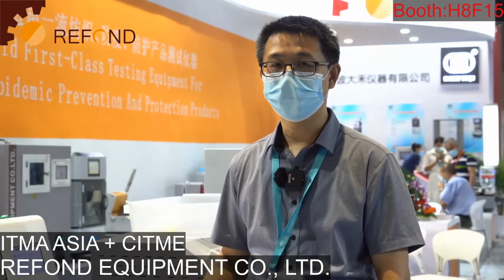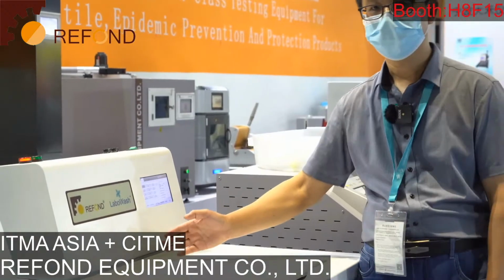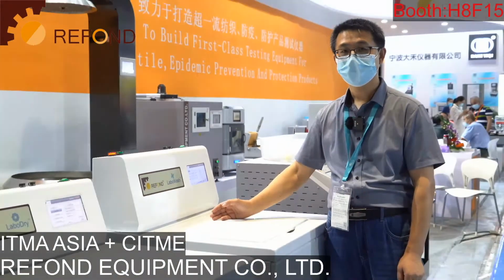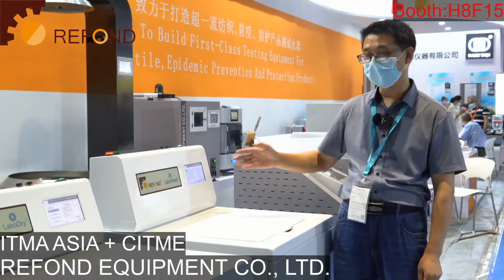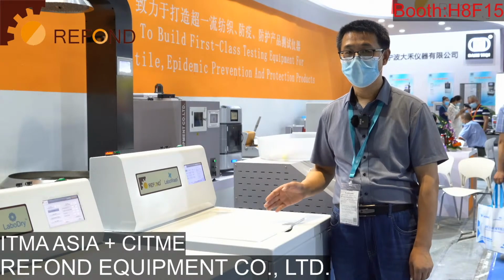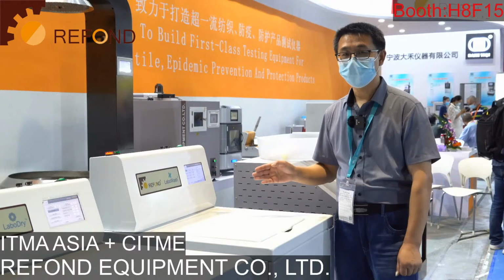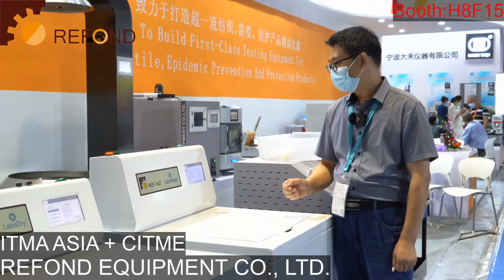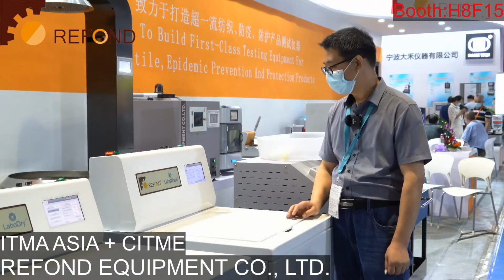Let me introduce our equipment. This is the LaboWash. This is a LaboWash washing machine. This is for AATCC laboratory procedure 1. The LaboWash washing machine can meet the AATCC testing standard laboratory procedure 1, table 1.